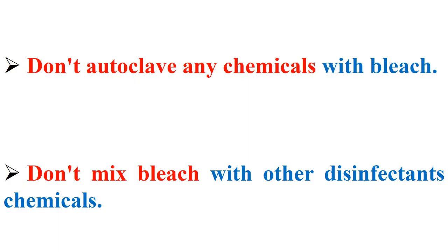But, pay attention please, don't autoclave any chemicals with bleach, and don't mix bleach with other disinfectant chemicals.